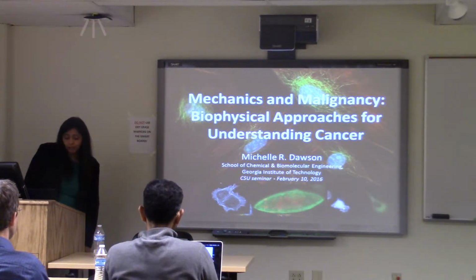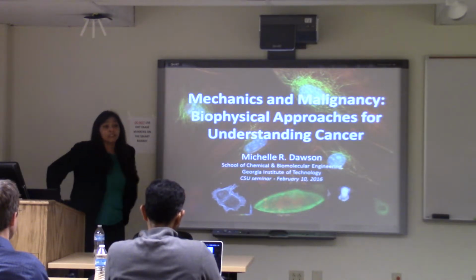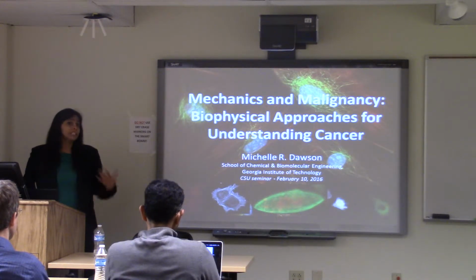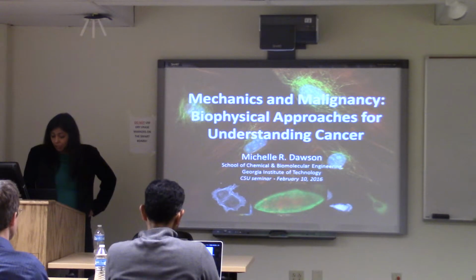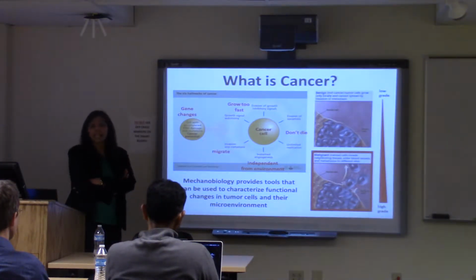And so a lot of my work involves microscopy, using microscopy to image different elements of the cell, and then trying to quantify parameters based on microscopy and images. And a lot of my work is specifically related to cancer.